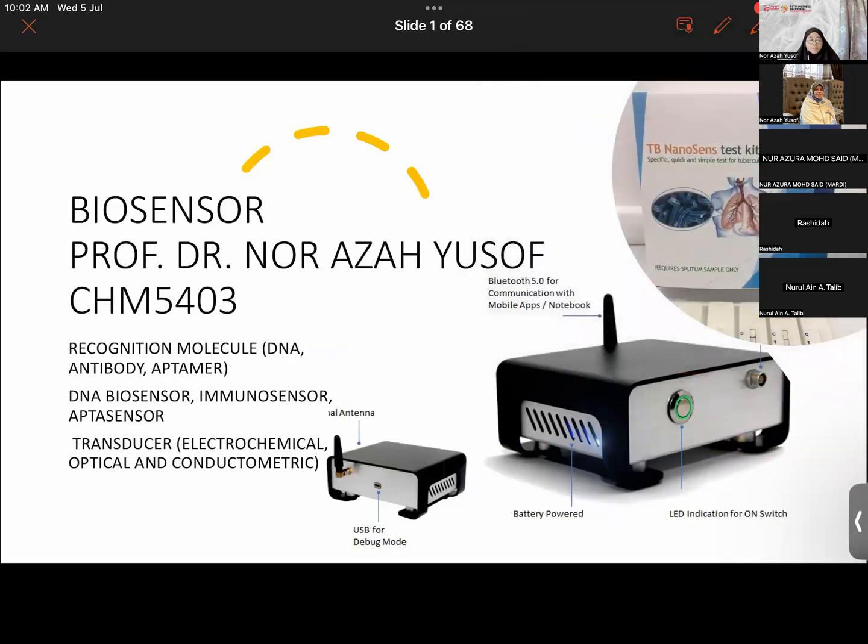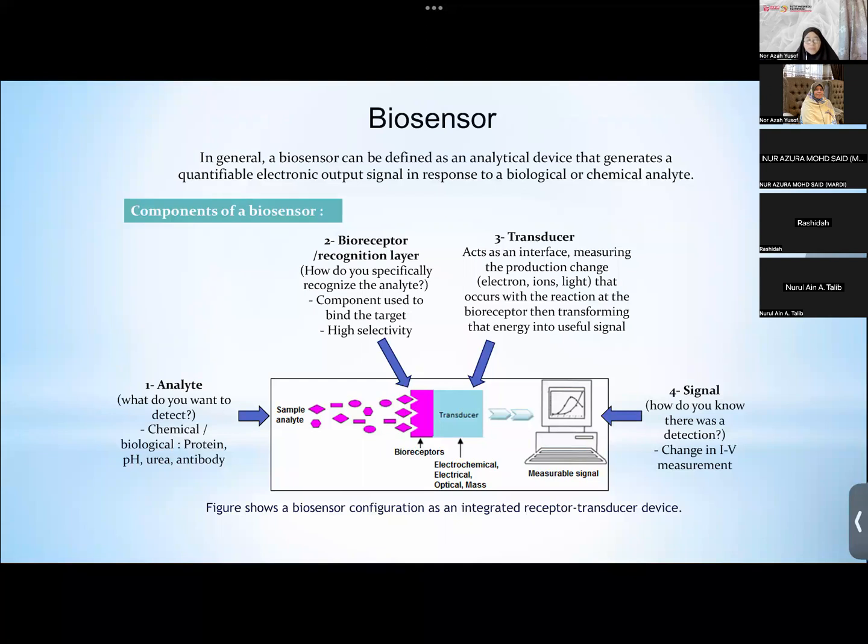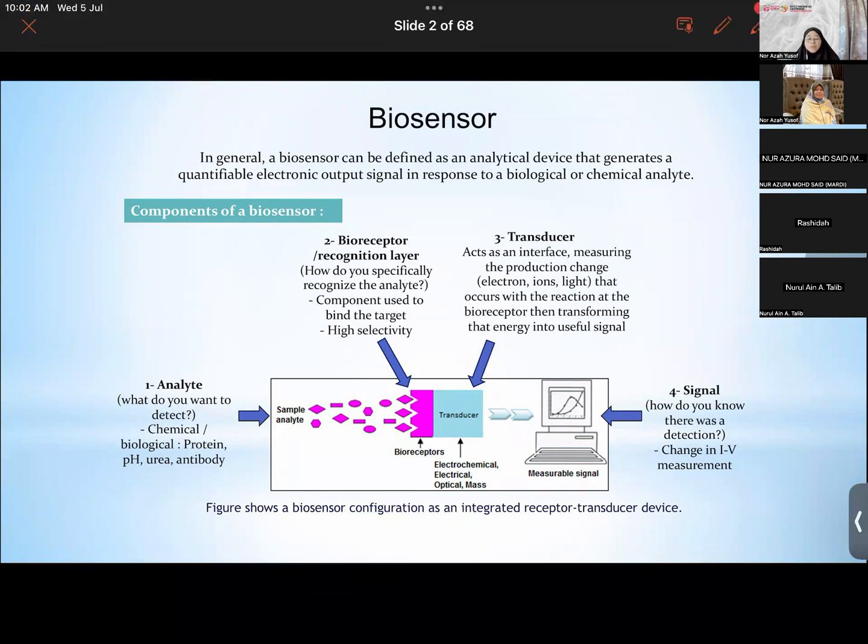All right, so the first thing that we are going to look at is the basic structure of biosensors. We have a lot of experts here, but just to introduce to those who are not familiar. There are many things important in the basics of biosensors, including lateral flow, which is considered a biosensor. But the one thing that we call the heart of the biosensor is the bioreceptor.